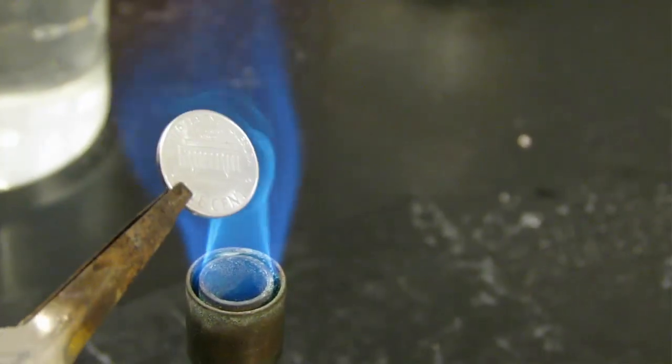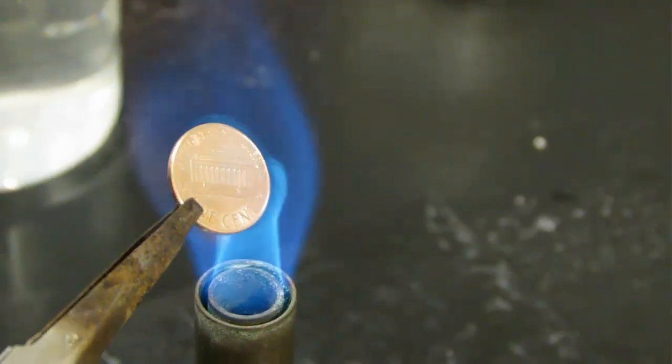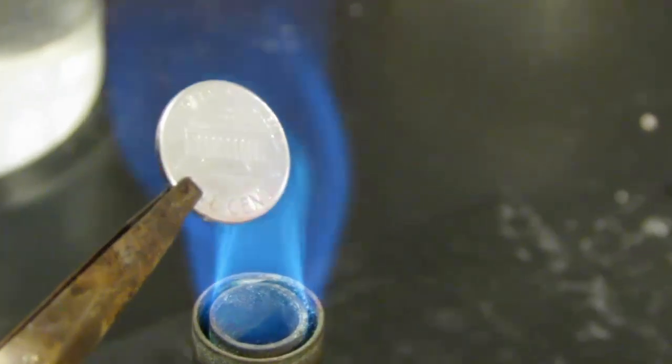When we apply heat, that layer of zinc is going to melt with the copper beneath, and we're going to end up with brass — which you saw happen right there.